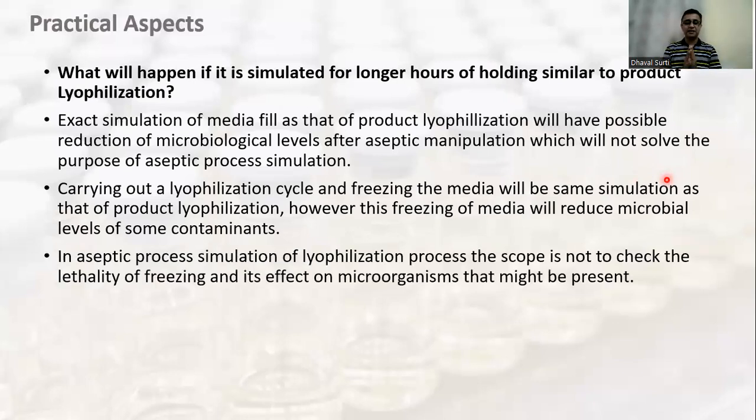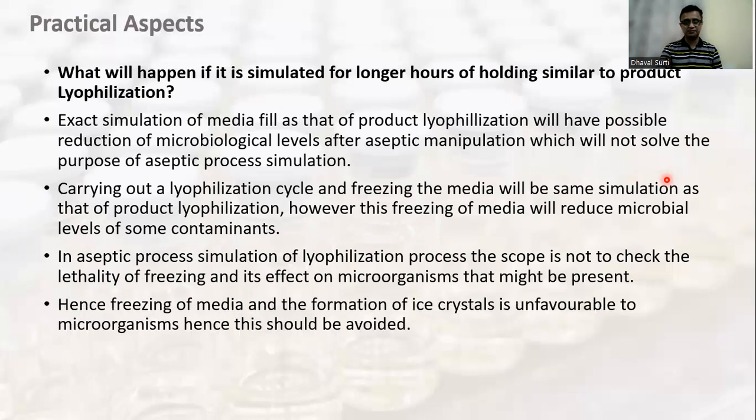Then, aseptic process simulation of the lyophilization process. The scope is not to check the lethality of the freezing. This must be understood. In the lyophilization process, freezing is not a sterilization process. Freezing is just to achieve a solid product, which will then go for the sublimation process. So here the purpose is not to kill the microorganism by freezing. It's just for the lyophilization process. So we don't have to simulate the freezing as a process.